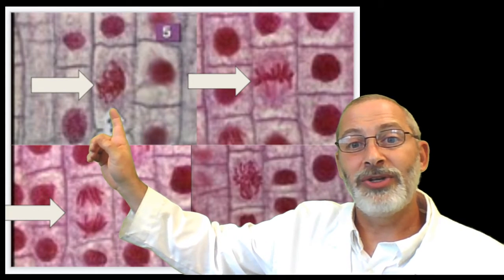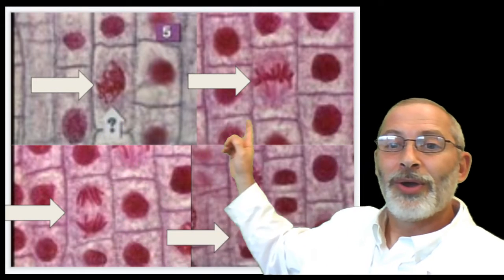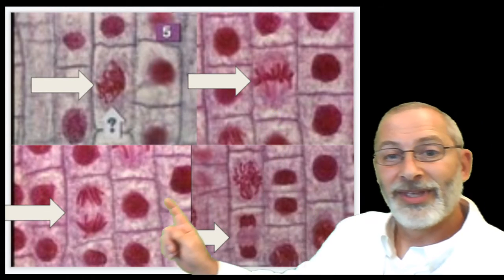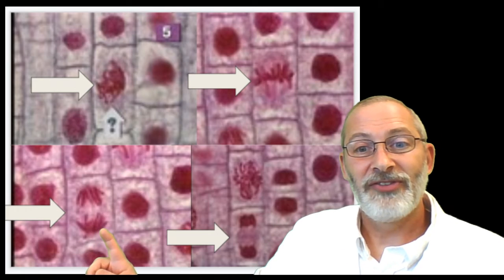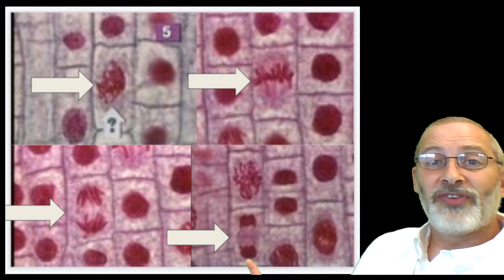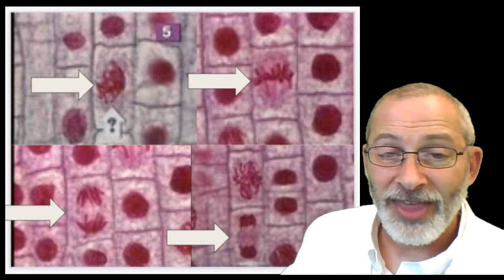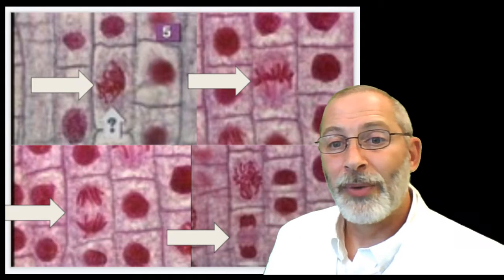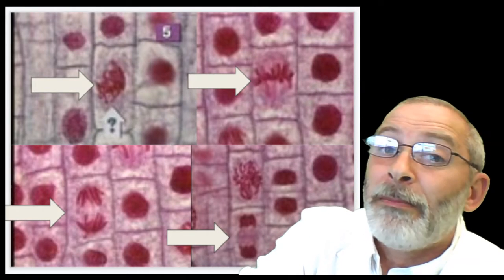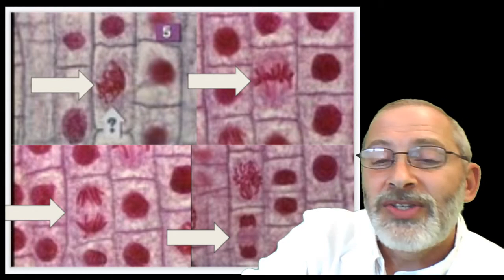What do you think is happening during this phase? What about this phase? Next, this phase. And finally, this phase. Well, let's see how you did, because I examined them very closely when I took the pictures and put them together and examined them under perhaps better clarity and magnification than what you can see on the board. So let's see how you made out.